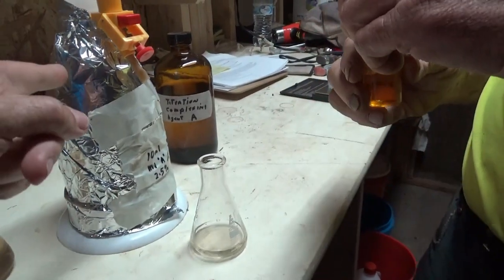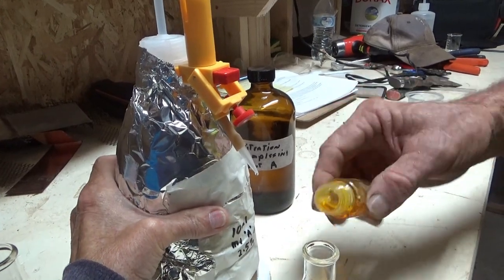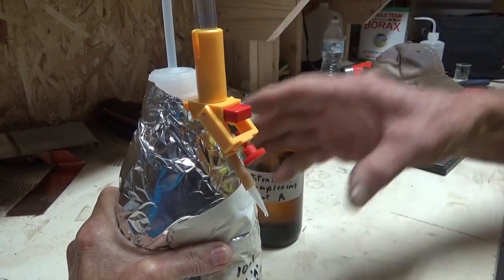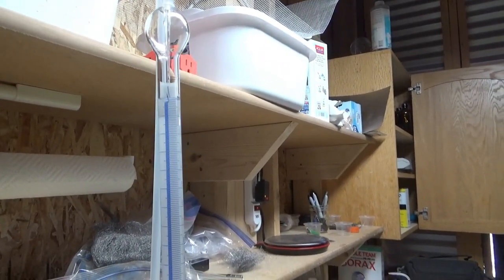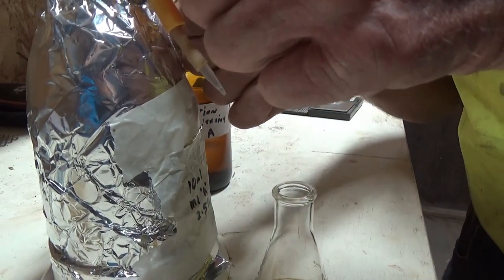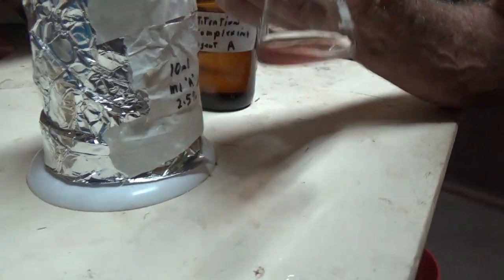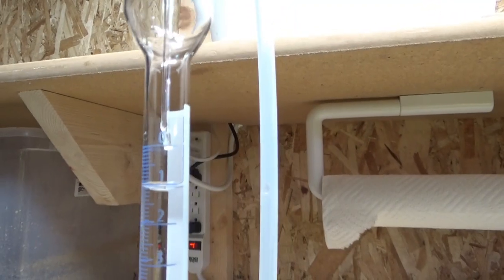And we want to refill our thing again. Go ahead and refill it. Should be able to do that with one hand. Takes time. Okay, there you go. That's it. Okay, so we've got our reactant. And this one, I suspect, is going to be very, very... There! It went fast. Oh, yeah. So we only got about 1 milliliter there.